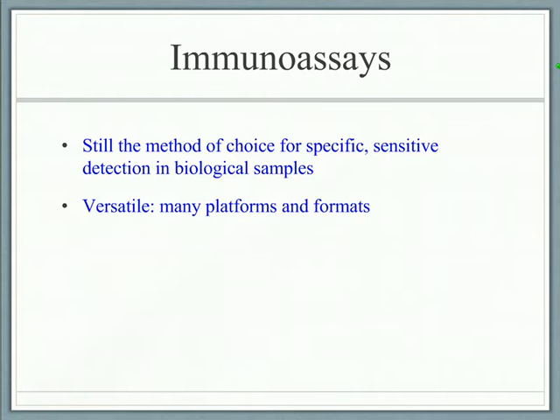Another valuable aspect of immunoassays is that they can be used in many different platforms and formats, from microchip or bead-based, as well as microfluidic platforms. Other types of novel platforms are amenable to using antibodies.